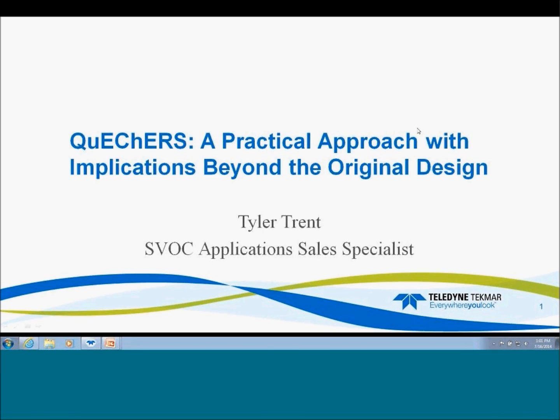In today's presentation, we're going to be covering topics of what is QuEChERS, a little bit of troubleshooting of QuEChERS, the Automate Q40, which was designed by Teledyne Tekmar, and then two experiments that we went through. One is an apple juice validation with a partner laboratory, and then a validation of the EN 15662 2008 method for QuEChERS also.